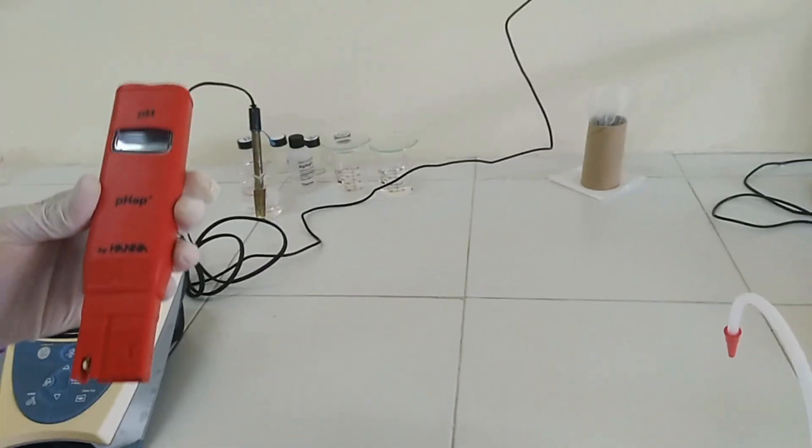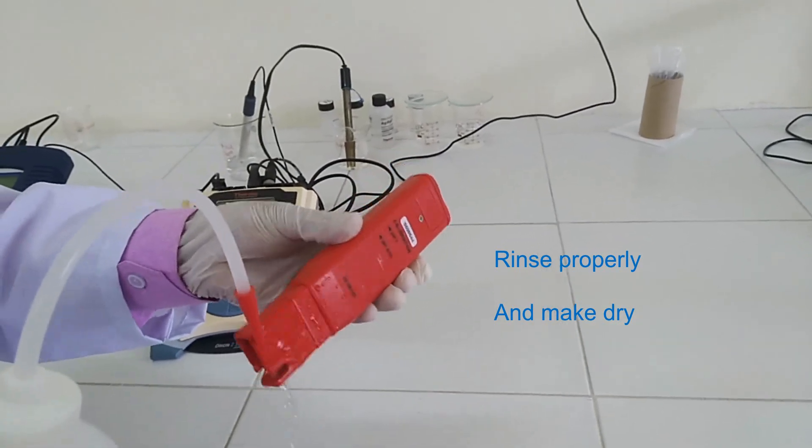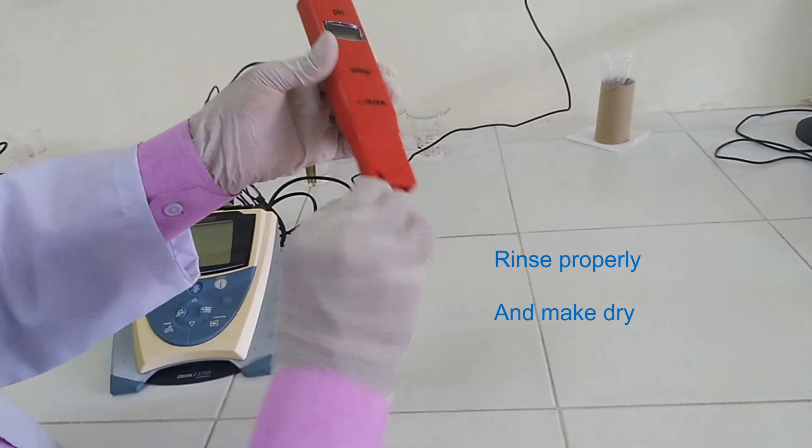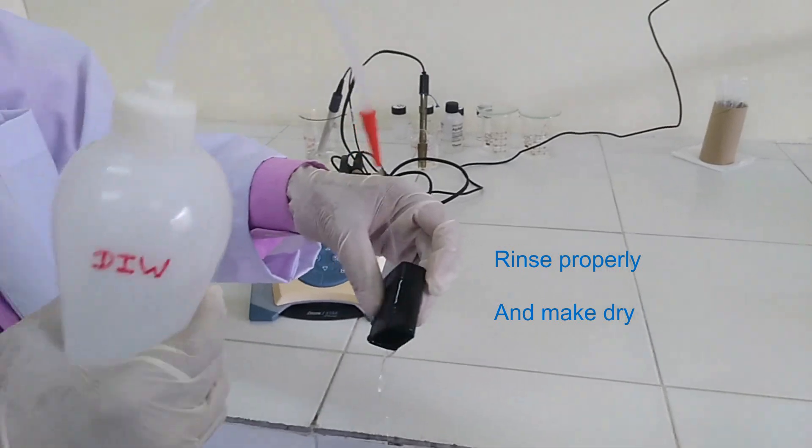Take pH meter, rinse with deionized water, and make it dry by lint-free DC paper. Never wipe a glass ball of electrode with DC paper because static cells will build up. Also rinse and make dry the cap.